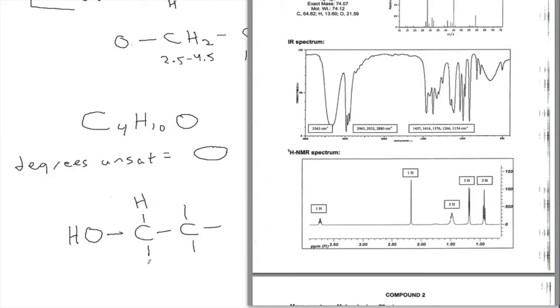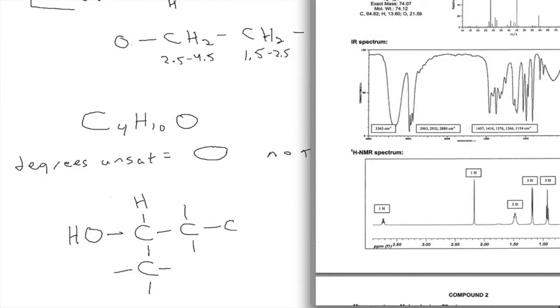What element is this? Carbon. Because it can't be a hydrogen, and I can draw in 3 bonds here. And I can even go a little bit further. Notice I only got 1 carbon left. So I may as well draw that carbon here. There's really no other place I can put it. I could put it here, but that would be symmetrical. And that has a bunch of bonds. And now what? Well, you really only have hydrogens left, right? So you might as well fill them in. So we're done, aren't we?